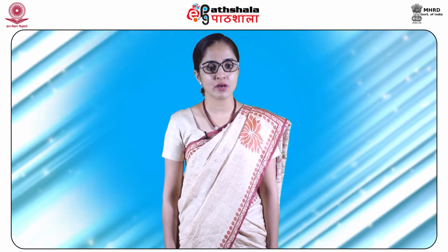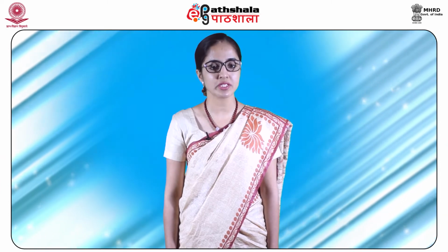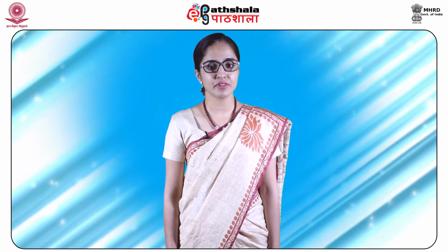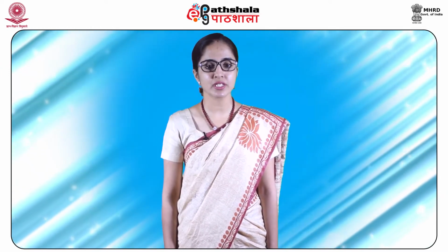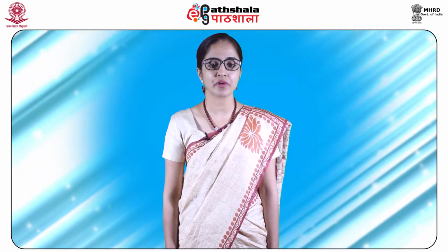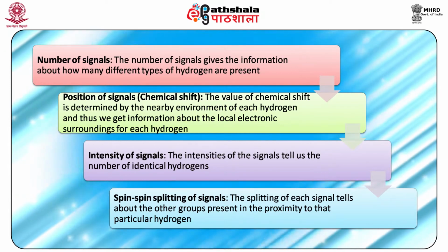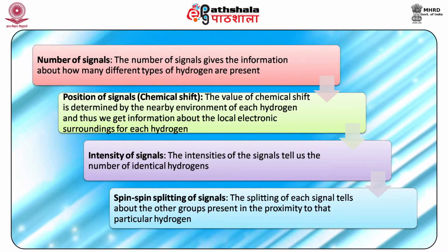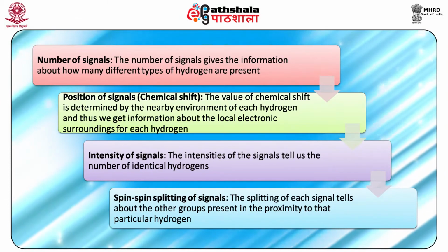Introduction. Now students, let us learn about the introduction of this chemical shift and what it means. In general, there are 4 different features of an NMR spectrum which provide important information about the structure of a particular compound. First is the number of signals involved. The number of signals gives the information about how many different types of hydrogens are actually present in a molecule that is being determined.